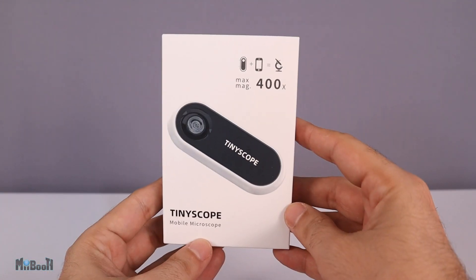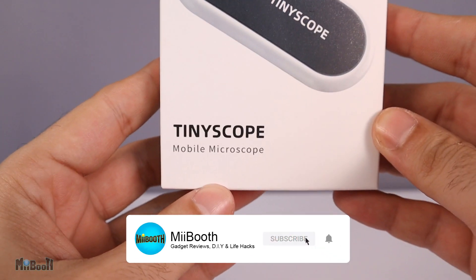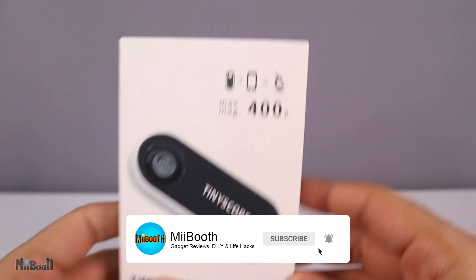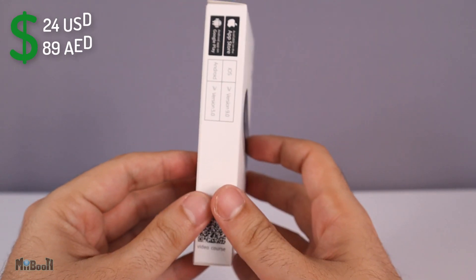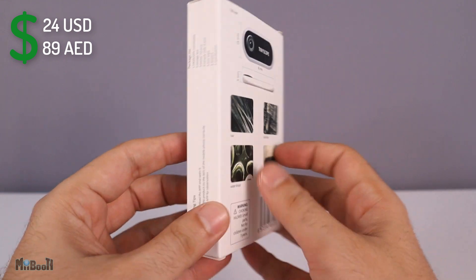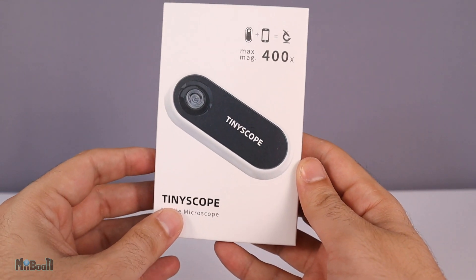This is the TinyScope mobile microscope, which claims to magnify anything up to 400 times and sells for 24 US dollars. It doesn't require batteries or wires — all it needs is a smartphone camera.